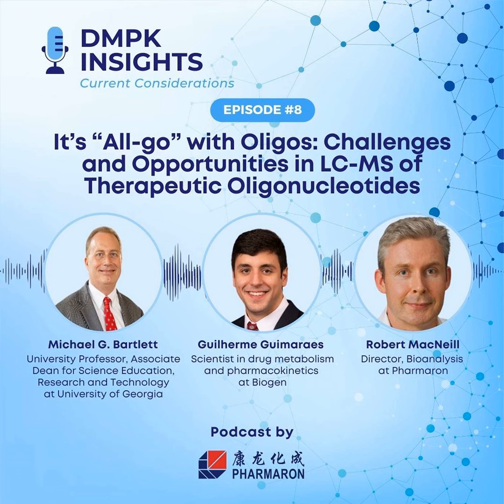So gentlemen, I guess we can get started with the subject matter. And of course, I promised not to make any jokes about making sense or anti-sense in conversation. So collectively, we three are rather interested in alternative approaches to bioanalytical LC-MS of oligonucleotides. Can we begin by maybe elaborating on the possible reasons why ion pairing reversed phase became the historical default, if you will?